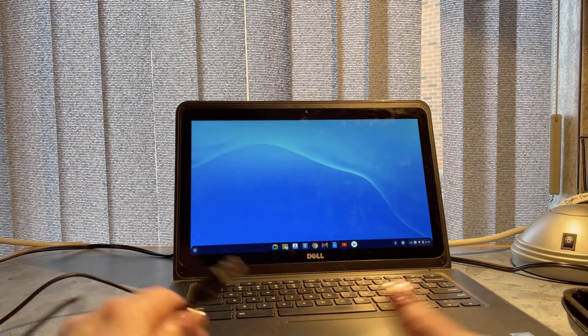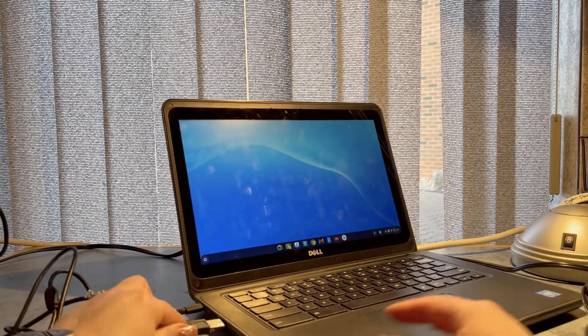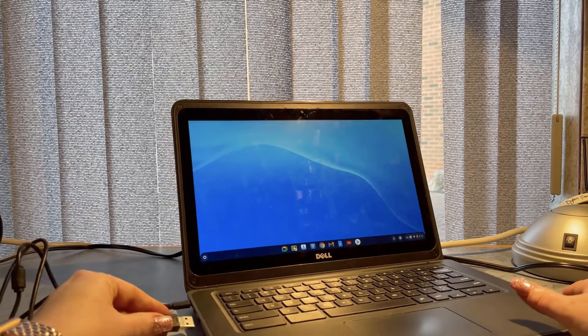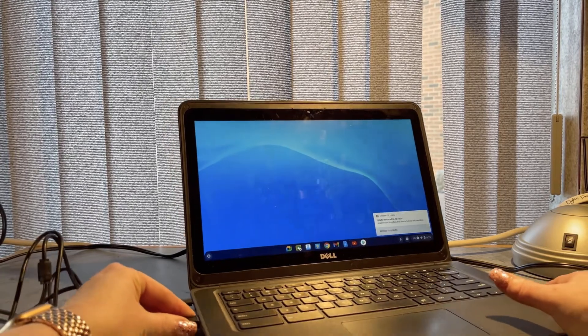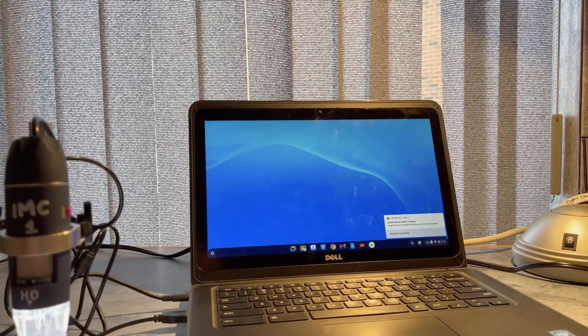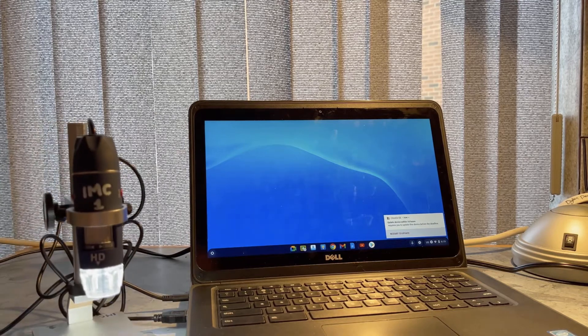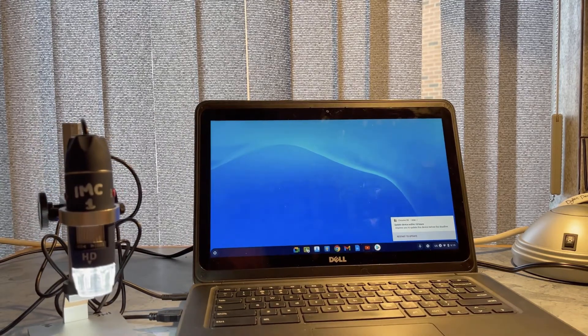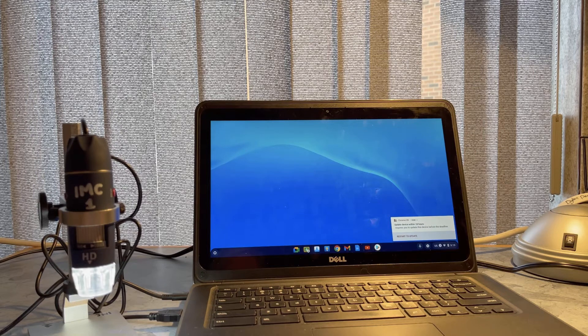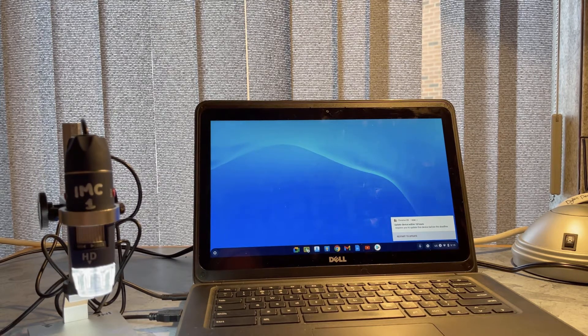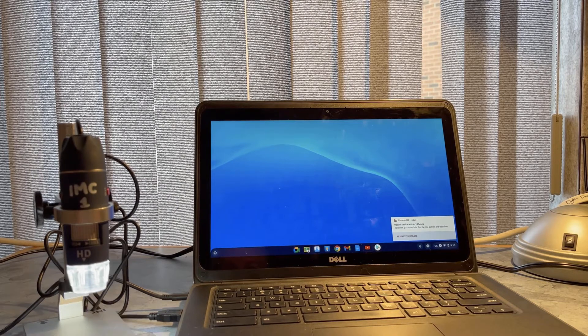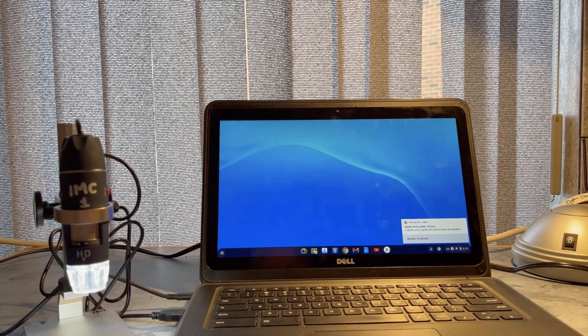I'm plugging it into one of the USB ports on my Chromebook. If you have a Chromebook that doesn't have the old-style USB ports and instead takes USB-C, do let me know because I have converters that will allow it to connect through USB-C, which is a slightly smaller input.